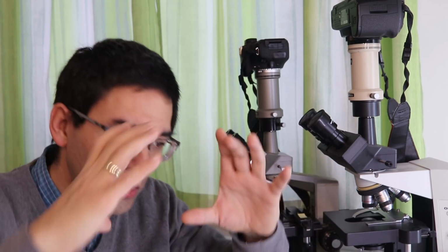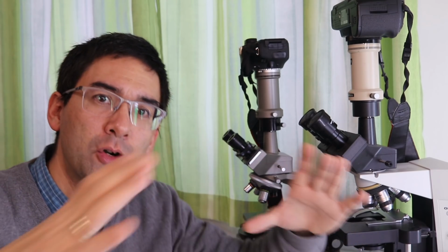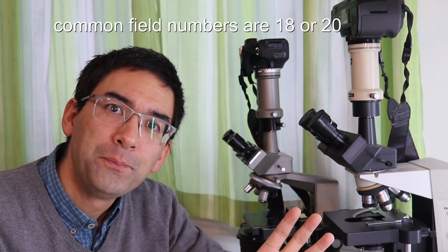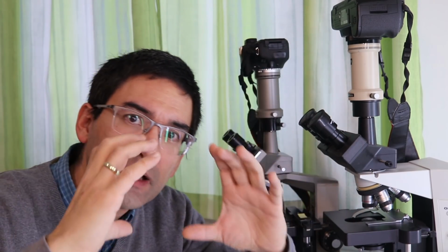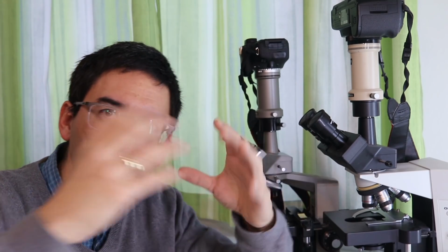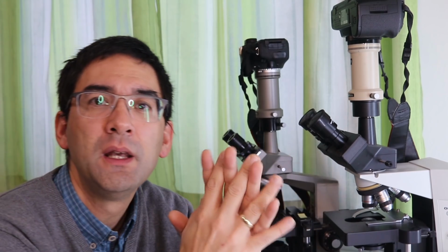Basically, the circle that you look through when you look through the eyepiece is larger. That means you see more of the specimen. The magnification is still the same, but it's less like looking through a tunnel, and you get a better subjective visual impression because you simply see more. This has the advantage that it allows you to navigate better.